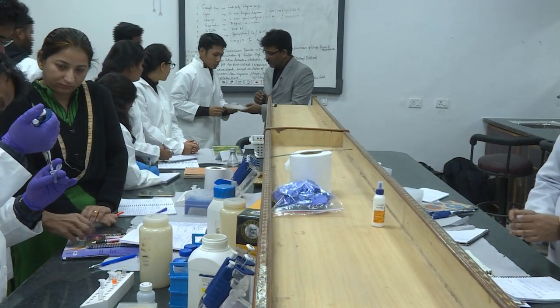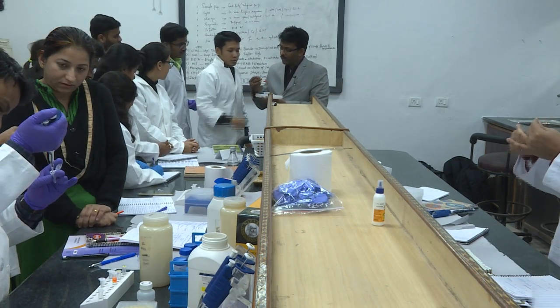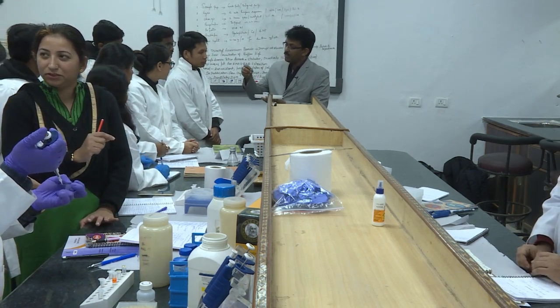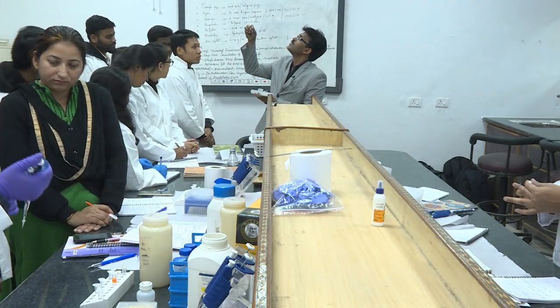How many tubes are there? DNA? So this is the DNA. Okay, final room. Yes. Okay, good. So now you start your amplification. Chemicals are with you? Sir, chemicals we asked for in full, sir.